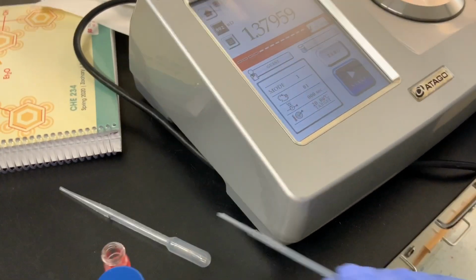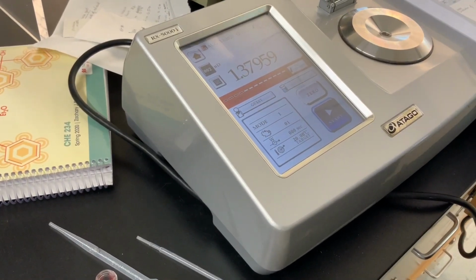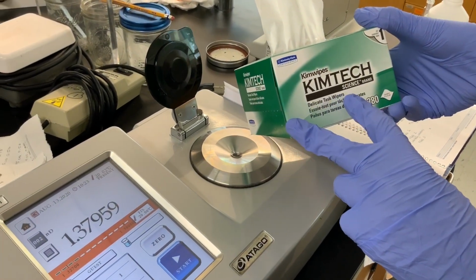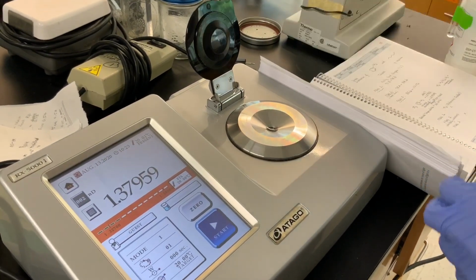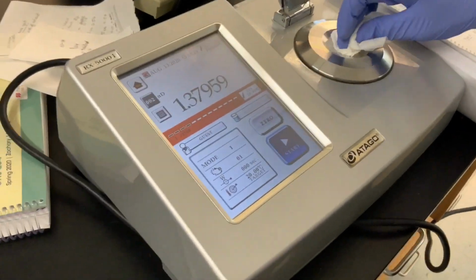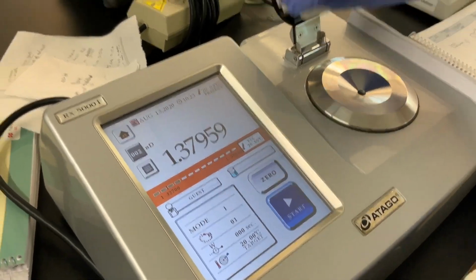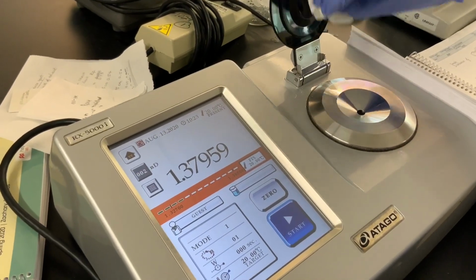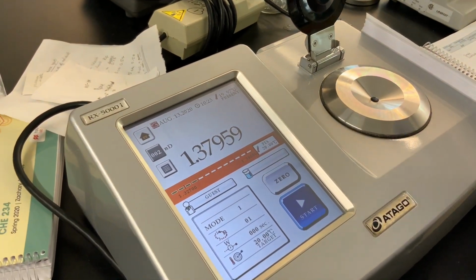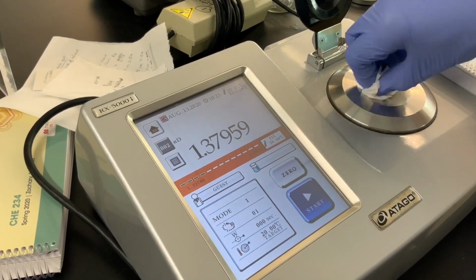and next we are going to take the refractive index of toluene. So I'm using these Kim wipes. They're delicate task wipers, I guess would be the generic term. And so it's nice because these do not scratch glass or quartz. So we would use these on this type of instrument. We use the same thing on our infrared spectrophotometer. So I'm cleaning off the hexane, letting it air dry while I walk over and go get the toluene.